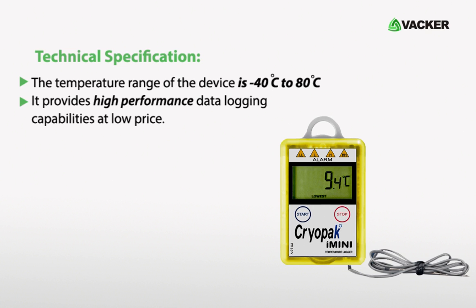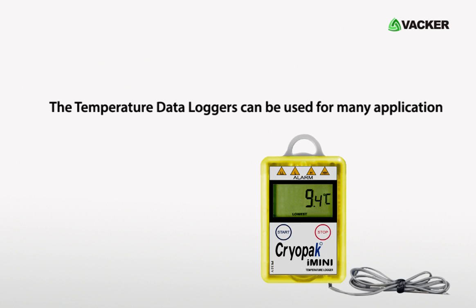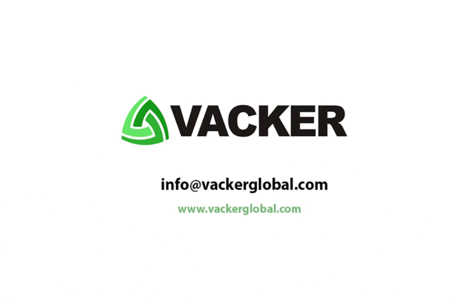The temperature range of the device is minus 40°C to 80°C. It provides high-performance data logging capabilities at a low price. The temperature data loggers can be used for many applications such as the healthcare sector, food processing, and hospital laboratories. VACA Global supplies all types of data loggers for industrial and commercial applications.